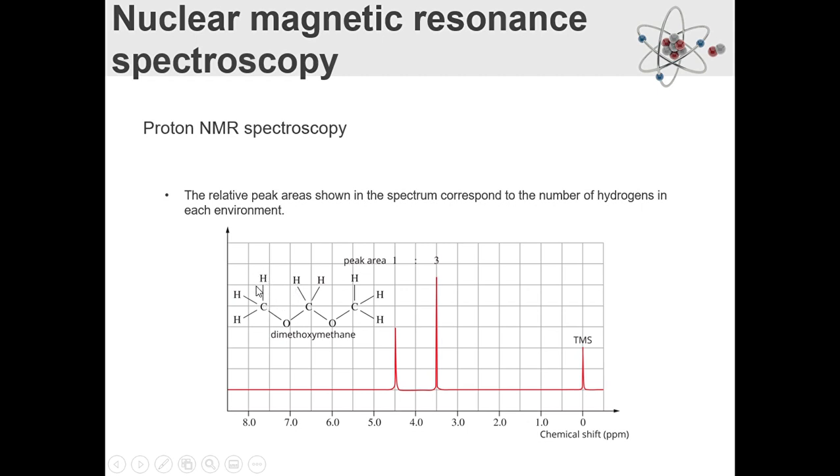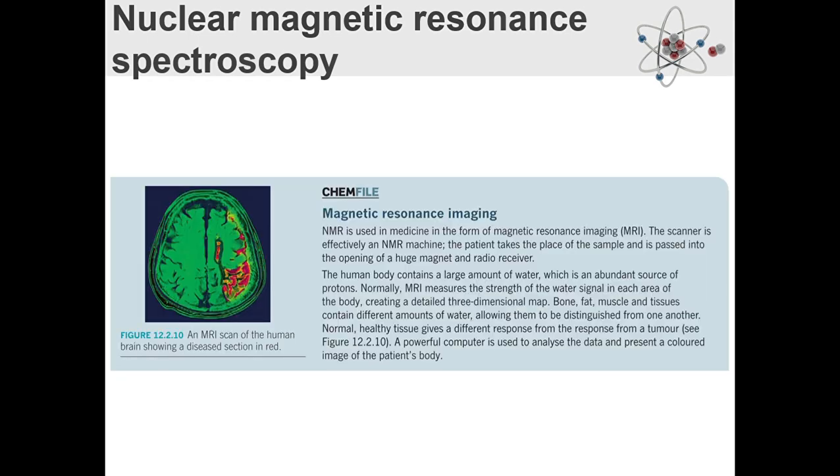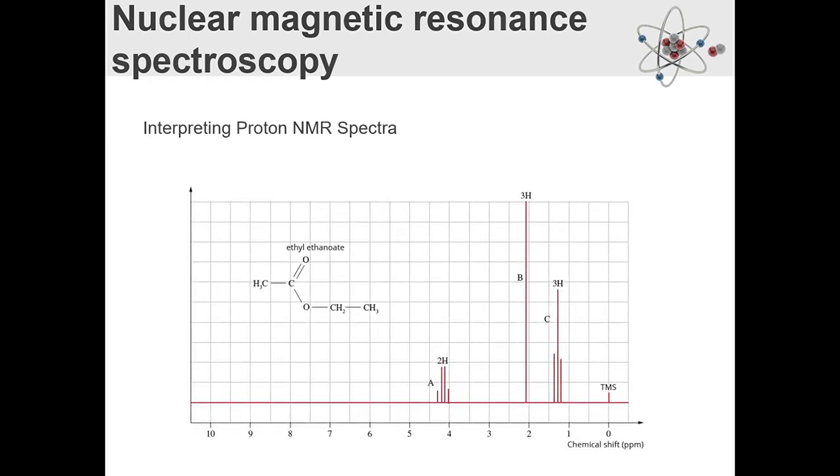Also, this hydrogen can't see the other end of the molecule because it takes 1, 2, 3, 4, 5, 6 steps. That's so far away. I am also recording this with a broken leg, so 6 steps is a lot for me too. I'm not just blaming hydrogens because, you know, it's easy. All right.